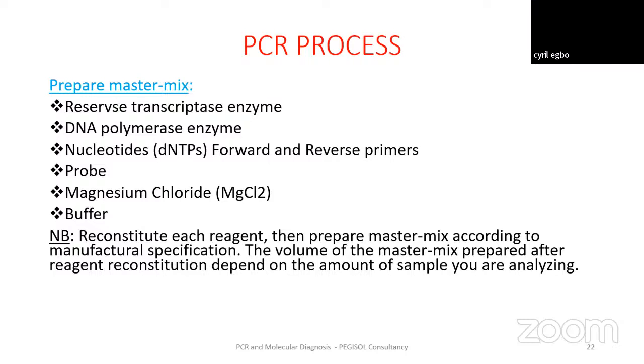So for instance, in DNA analysis, you are targeting one specific DNA. Maybe in that DNA, you are targeting a genetic information that is present at chromosome 5. So you are amplifying that chromosome 5 to get millions of copies of that chromosome 5 to make it detectable.